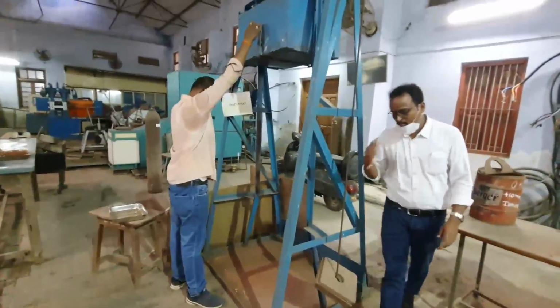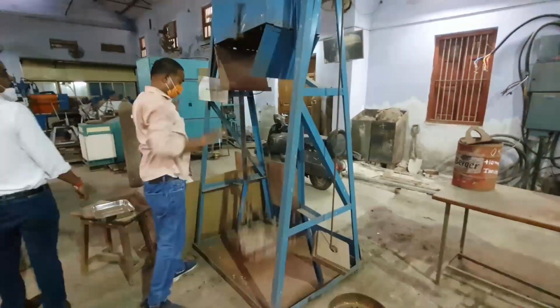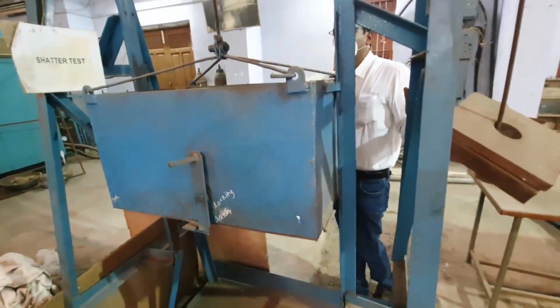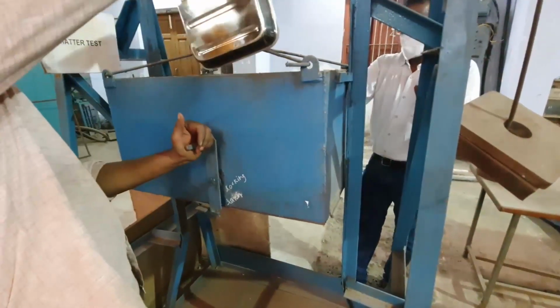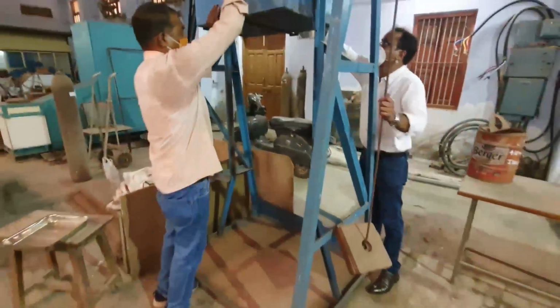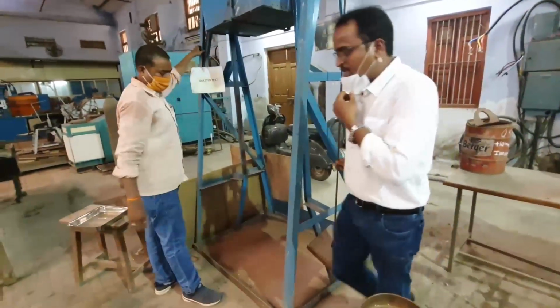So we are opening the bottom hinge. Third time we are putting the raw material, limestone, into this box, and we are making it fall.